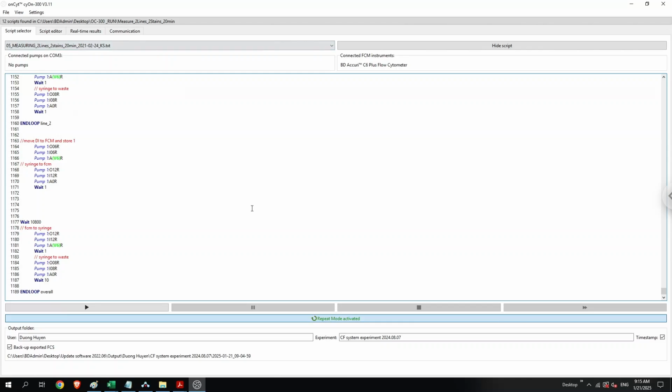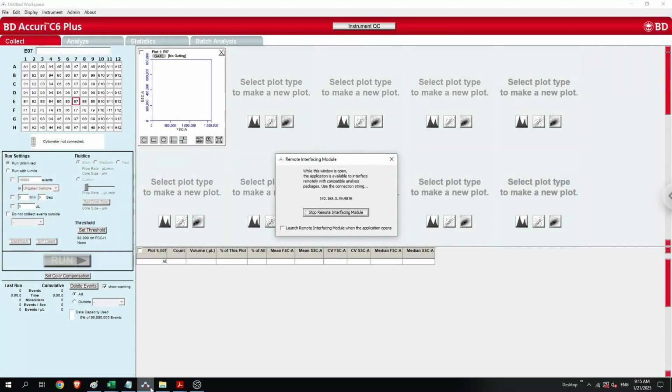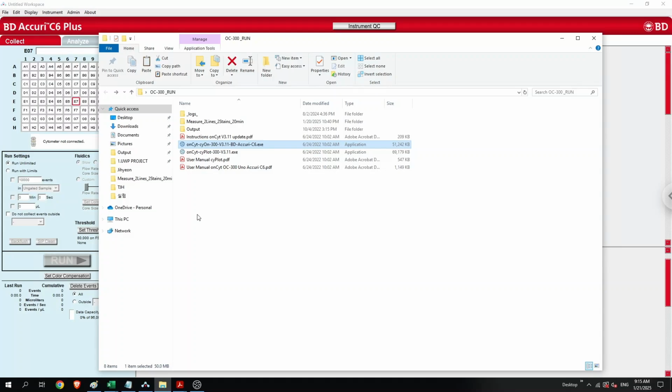Then I can explain later. Okay, so this is about on-site, and let me see. Always you have to stick with this. I think they explain quite everything here.